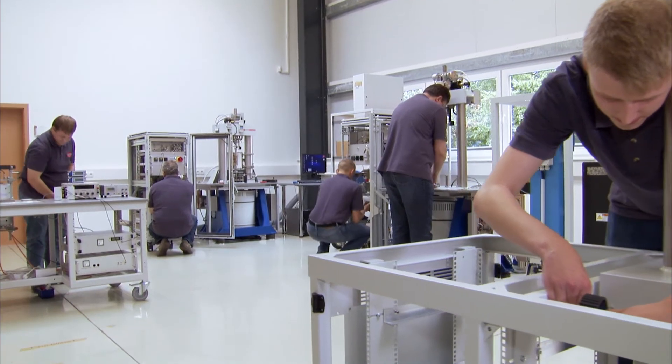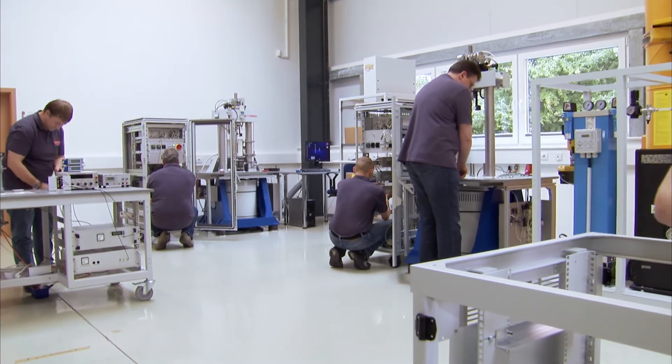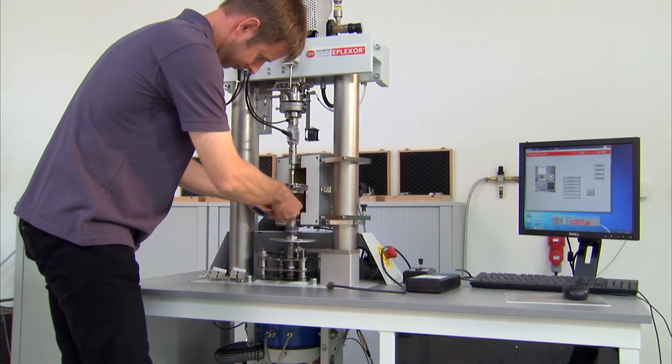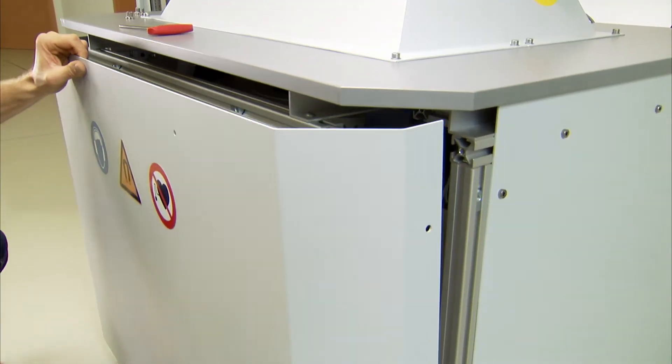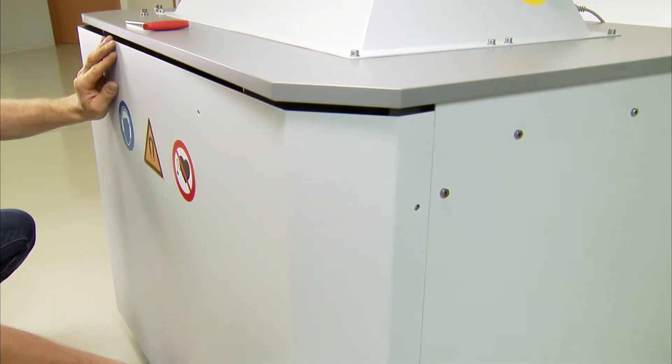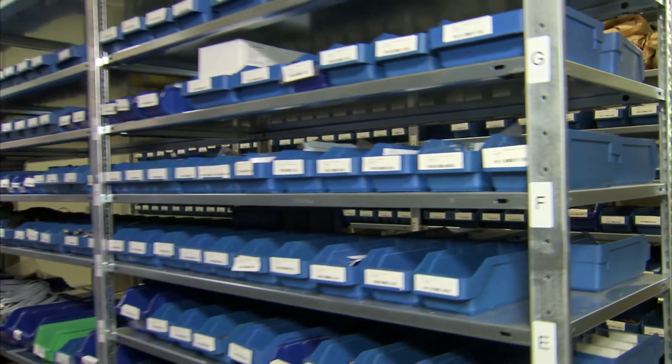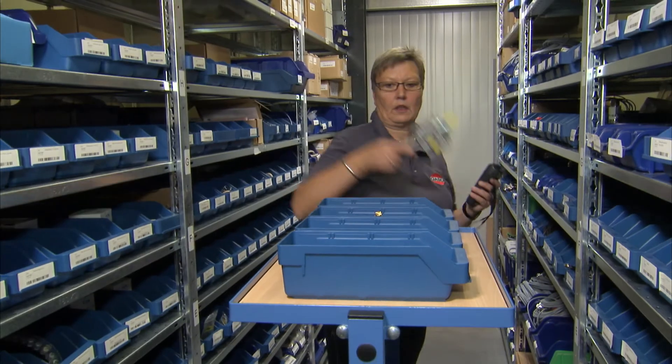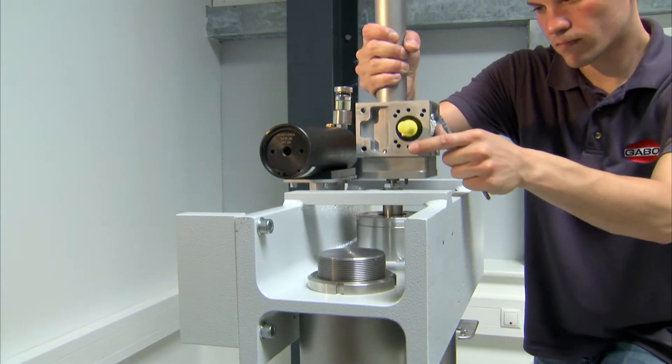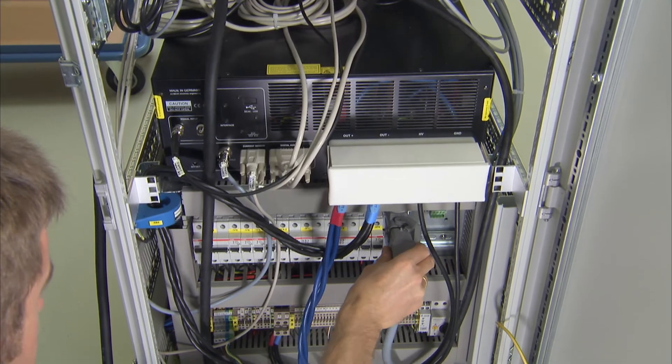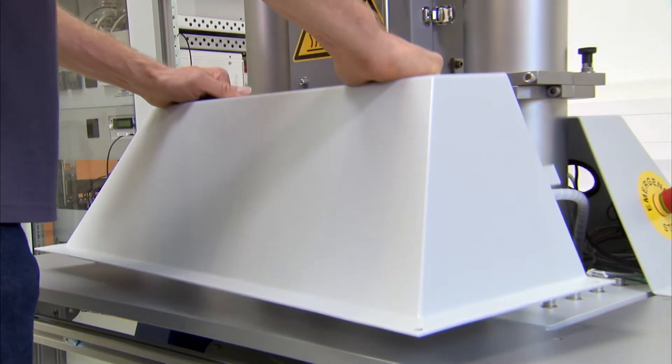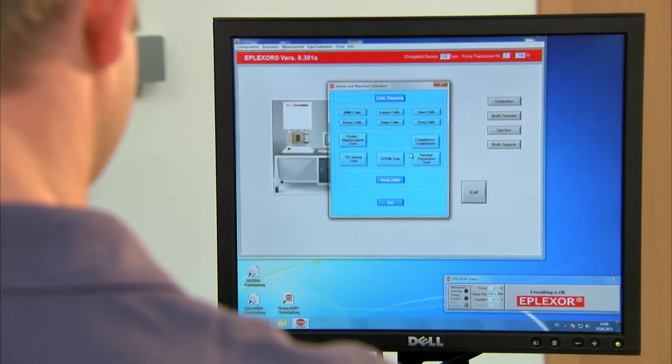The new production hall with parallel production lines allows for cost-efficient utilization of all capacities, including everything from inventory of device-specific components and assembly of mechanical components and control cabinet units to start-up of testing systems, including calibration, test measurement and programming of all system-relevant data.